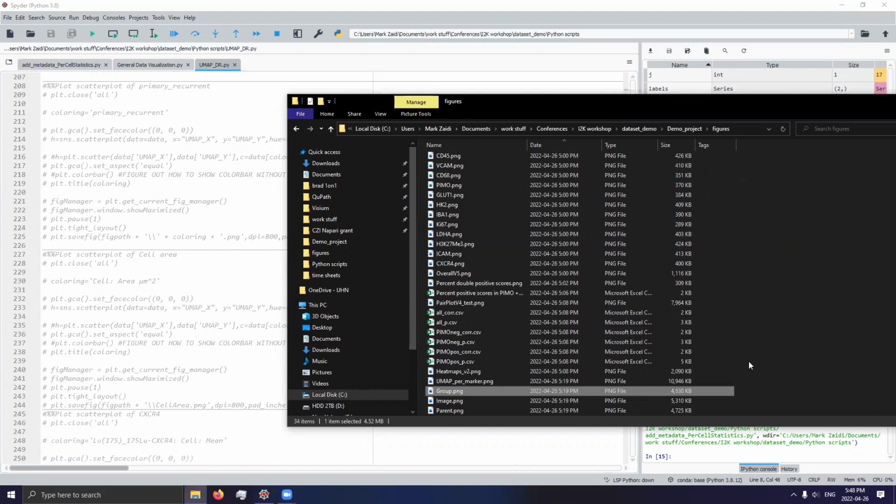If you have any questions with regards to setting thresholds, classifying cells, or choice of image segmentation algorithms, I'm really open to discussion. And if you have any unique methods that you've developed for analyzing high dimensionality data sets, I'm more than open to hearing about them.